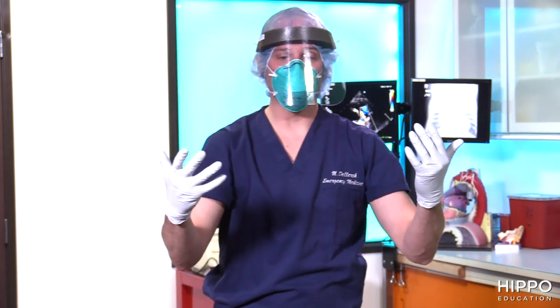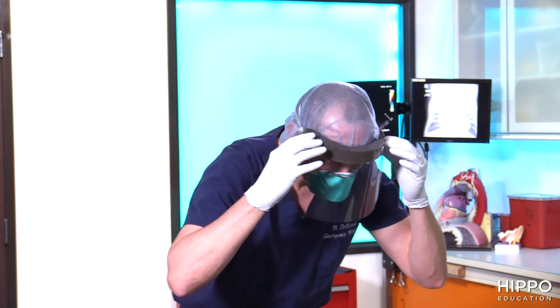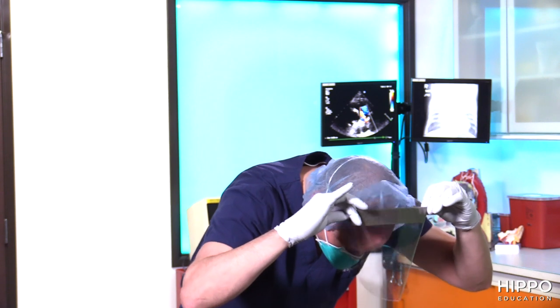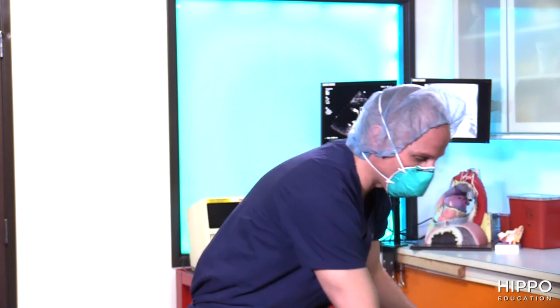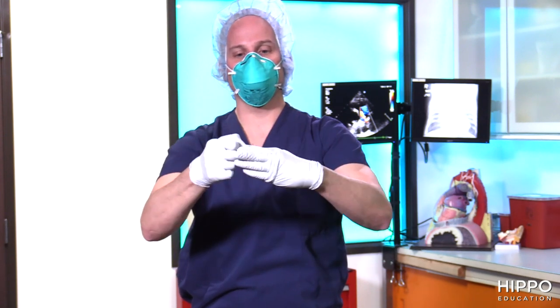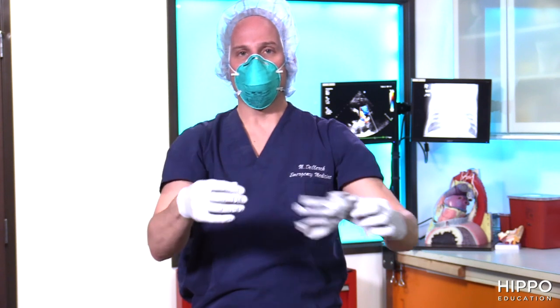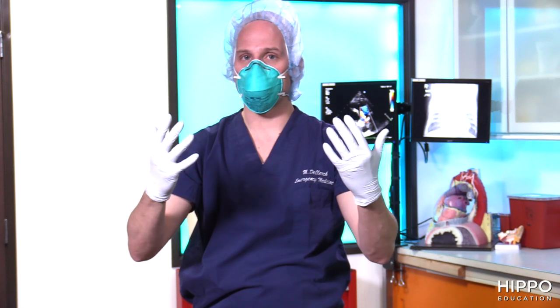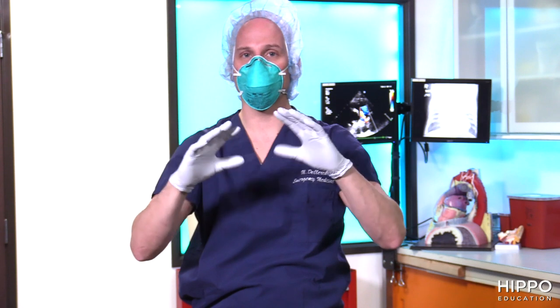Hand hygiene completed. Now we're going to do the removal of my face shield. I'm going to grab it from the side, pull over, and throw it in the trash. Next step, hand hygiene. And then if you recall, this is the step that you can now leave the area of aerosolized material. You want to keep your mask on until you're in a safe area where you're not going to have aerosolized particles.